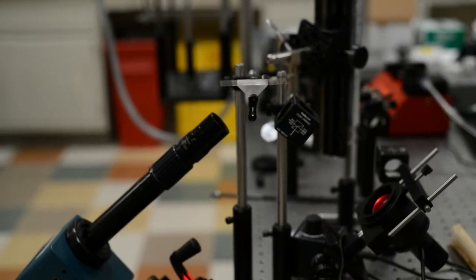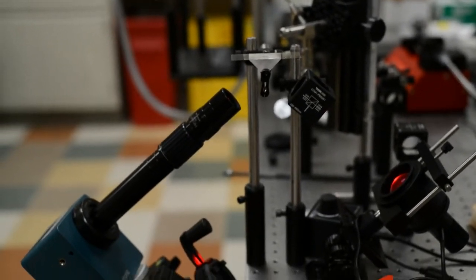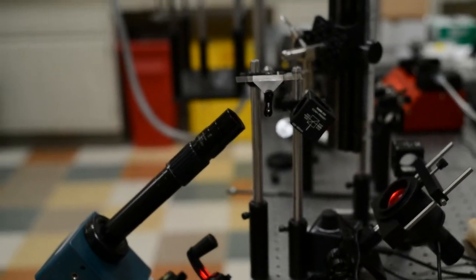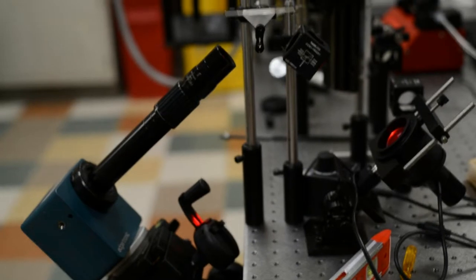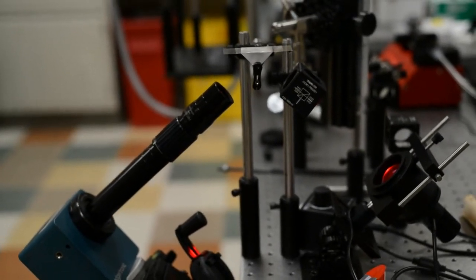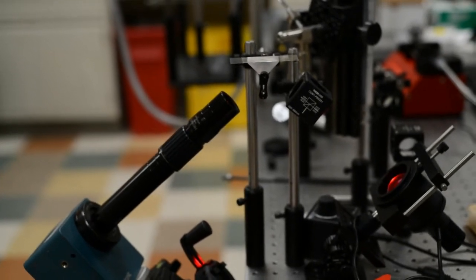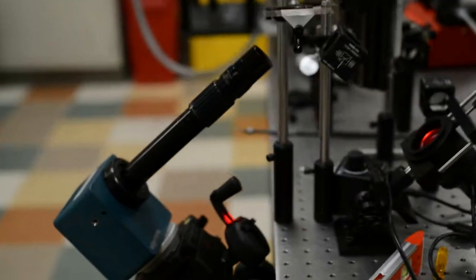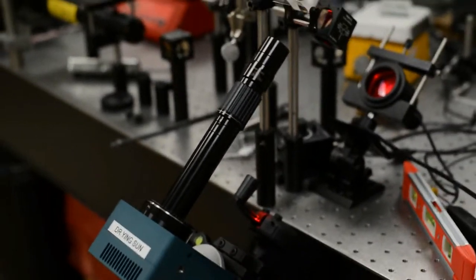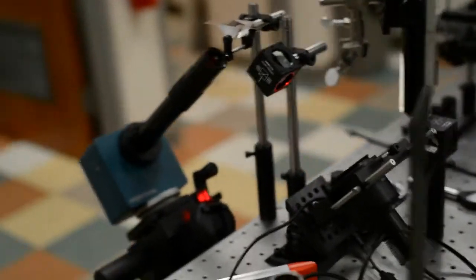and thus we can use that correlation to get the exact profile of the glass and compare this, for instance, with the exact curvature of the lens given to us from the manufacturer, as well as something like reflection interference microscopy to cross-check our results. And we get a very good agreement in our results when we do this. And so this is just an overview of the optics that are involved to set up this TIRM setup.